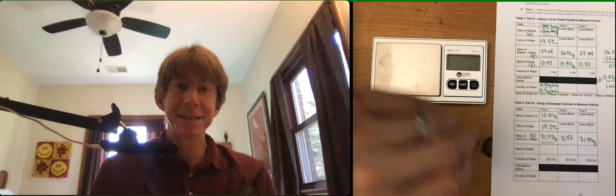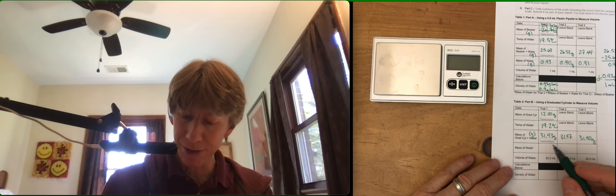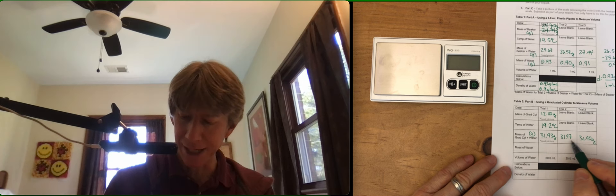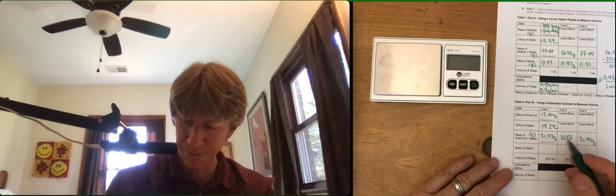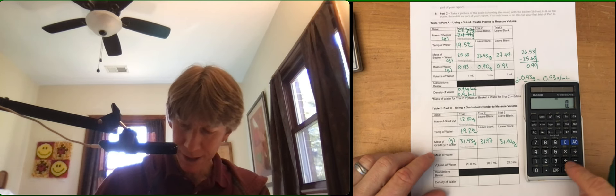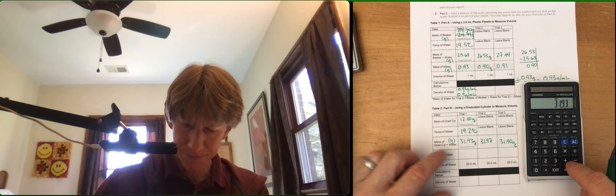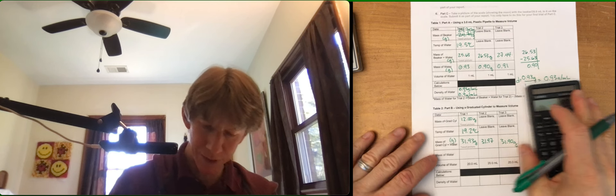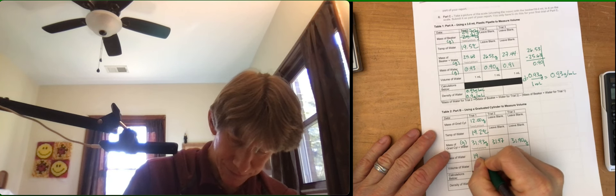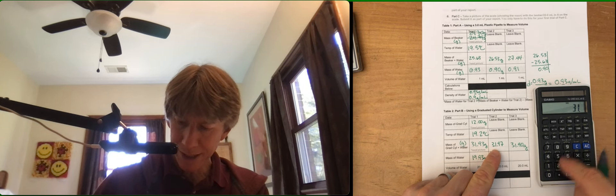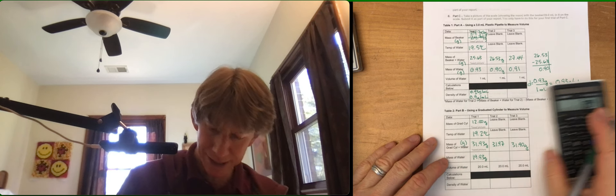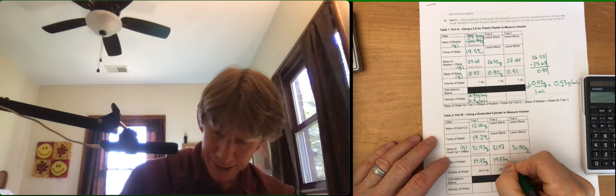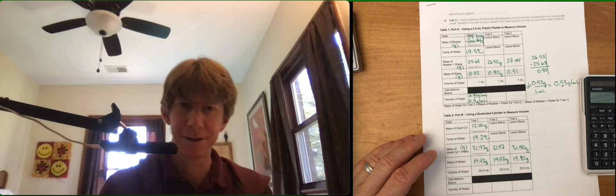Now this time it's going to be a little different than in table one and table two. Since we emptied it each time, we're going to do our subtractions each time back to the original one. So moving my scale and focusing on calculations. 31.93 minus 12.00, I get 19.93 grams. 31.97 minus 12, 19.97. And 19.90 grams.